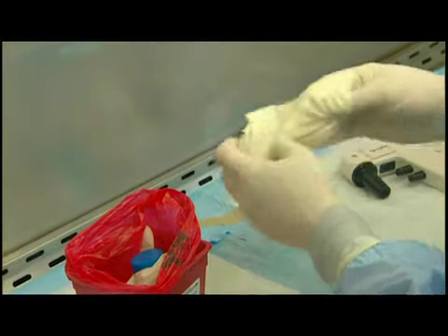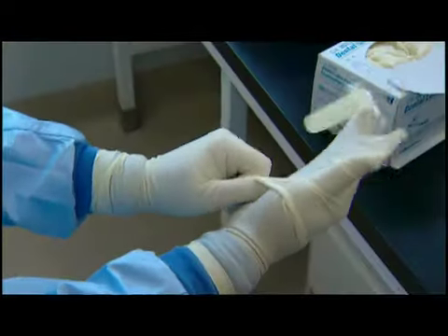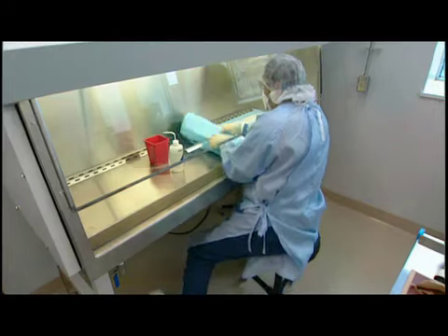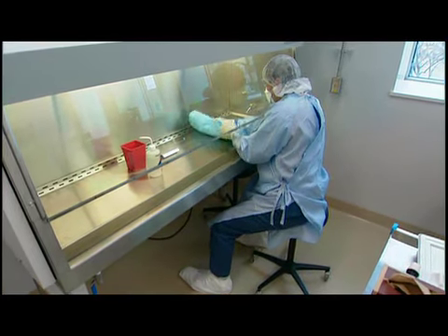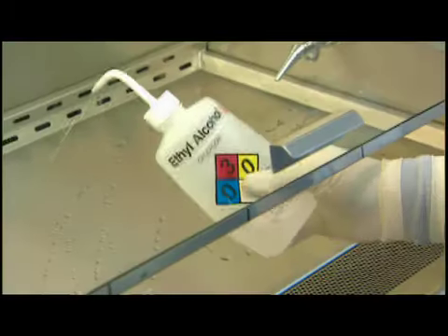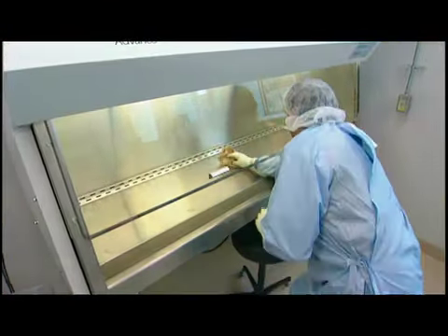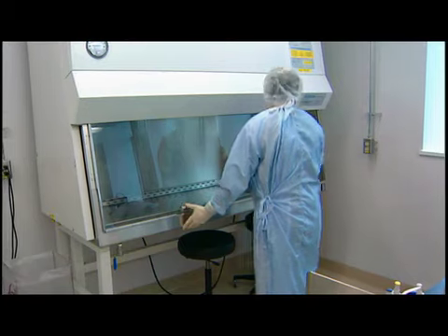Remove contaminated gloves, dispose of them appropriately. Don clean gloves. Disinfect work surfaces and outside of biohazard bag. Regularly disinfect hidden surfaces. Turn off fluorescent light and cabinet blower. Turn on ultraviolet lights and change gloves.